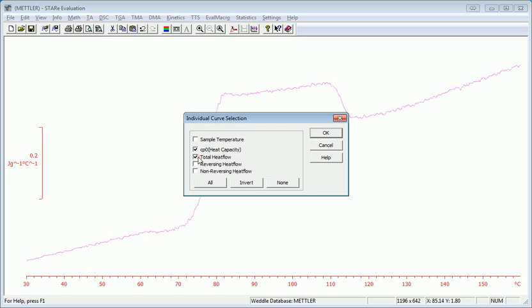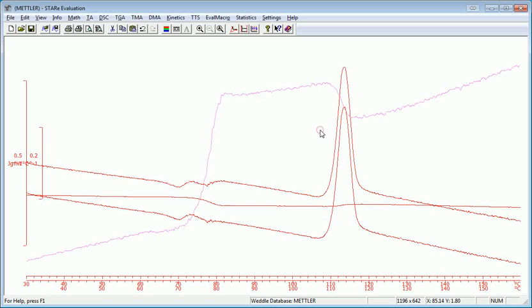So I'll go ahead and click total, reversing, and non-reversing. And hit OK.